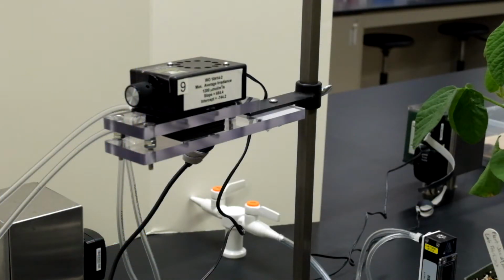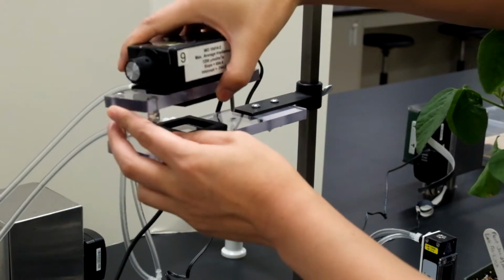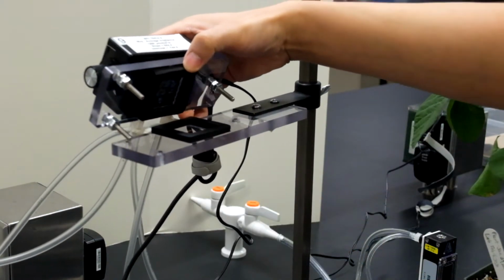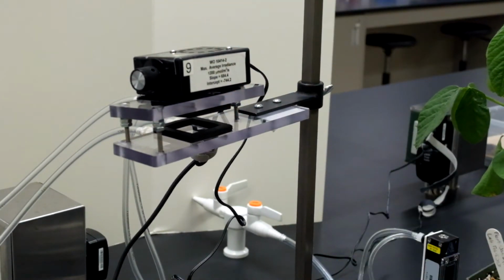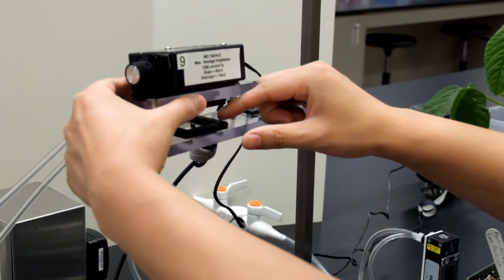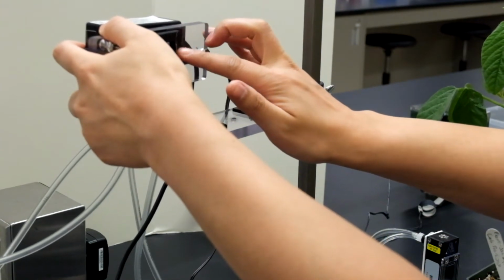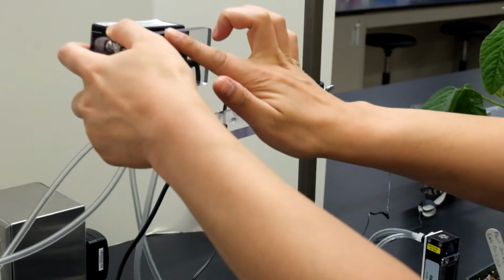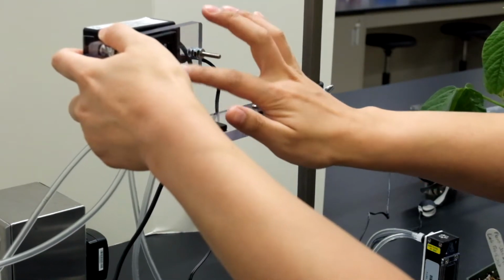To put a leaf inside the chamber, we first want to apply vacuum grease along the gaskets to ensure a proper seal. So we want to open up the chamber, get our vacuum grease, a small amount on your fingertips, and just apply it along the gaskets. You want to make sure that you don't get it inside the gasket because that's where the air flows along, and we don't want to clog up any of the flow.